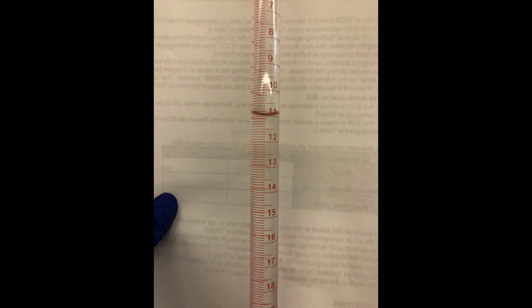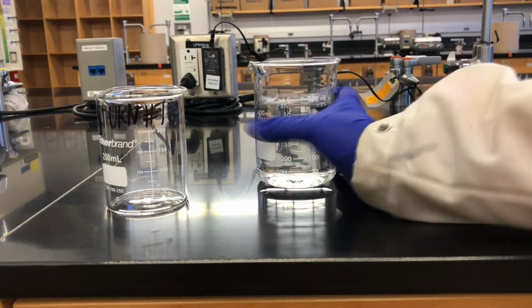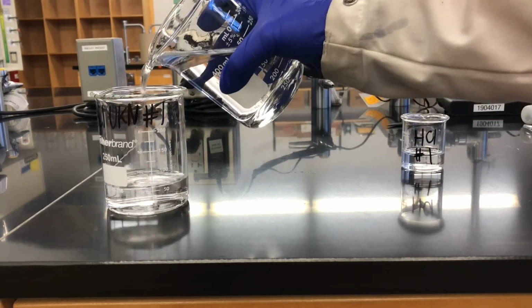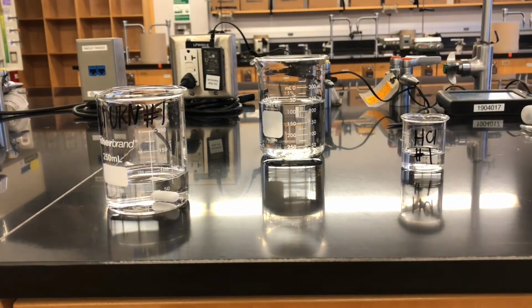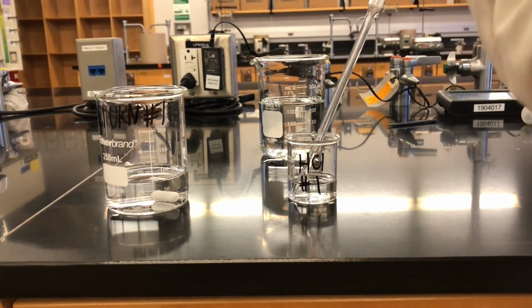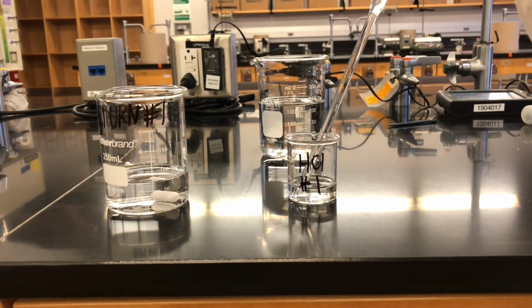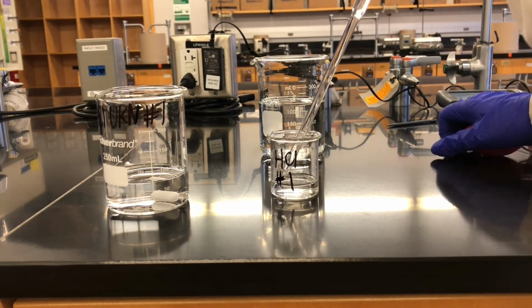After completing the fast run, we dispose of the reaction mixture into the waste and re-prepare the unknown HCl solution for the actual titration. Same as before, we add approximately 75 milliliters of water before using a volumetric pipette to add 5 milliliters of the unknown HCl solution, followed by a few drops of the phenolphthalein indicator dye. After placing the freshly prepared HCl solution onto the hot plate and setting up the pH probe, we can perform the full titration.